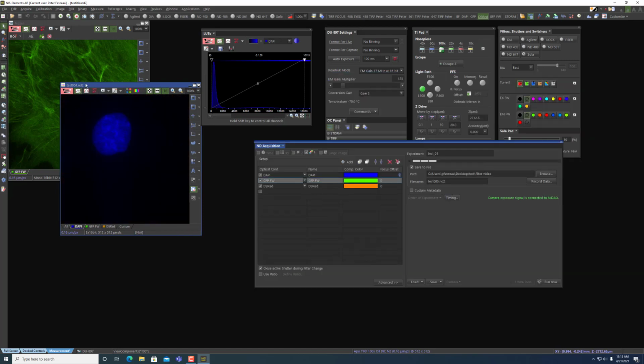At this point, you've got an ND2 file, which is your project file in Elements. You can save, again, as a TIFF file if you'd like. You can save it as a JPEG and so on. But I think for this video, I'm going to leave it here.